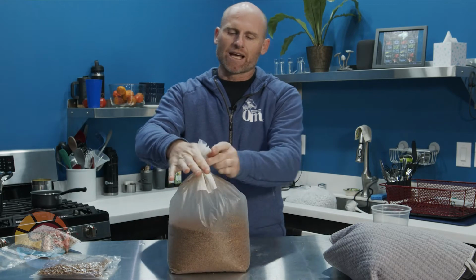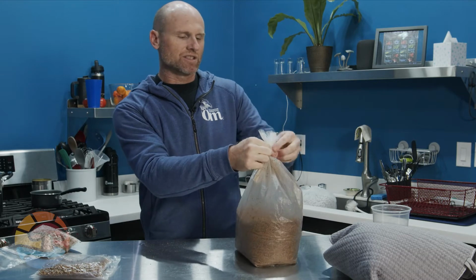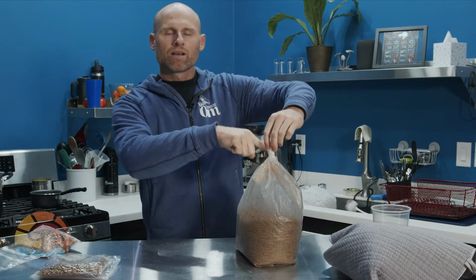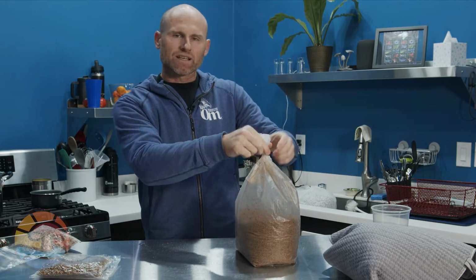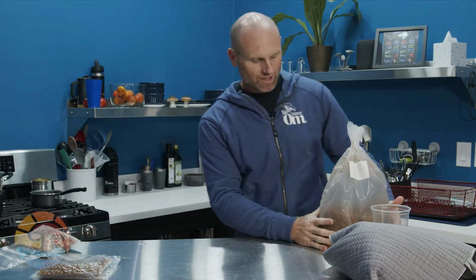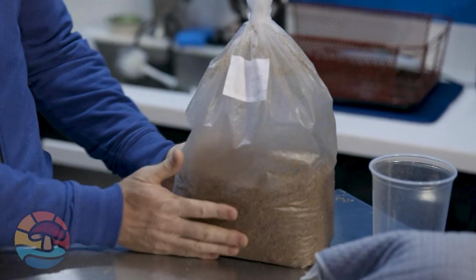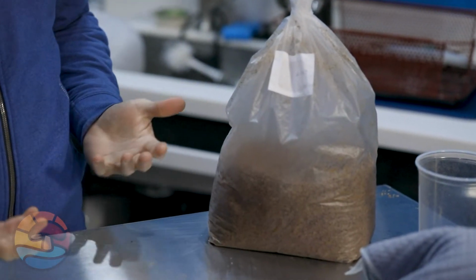Take the top of the bag, make sure that the filter patch doesn't get wound up where you're going to cinch it, and just take a zip tie or a twisty tie and tie the top of it. And all you've got to do is set that bag aside, and in about 2 to 3 weeks, you'll see a lot of mycelium start to coat the inside of the bag. And once it's pure white, you can fruit the bag.